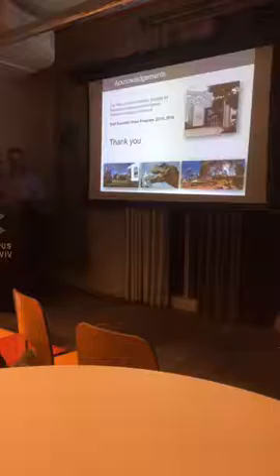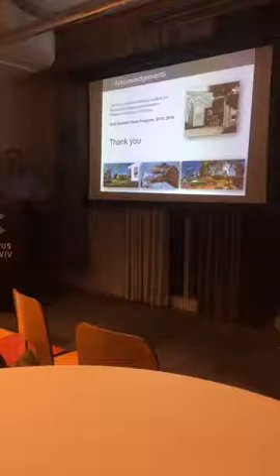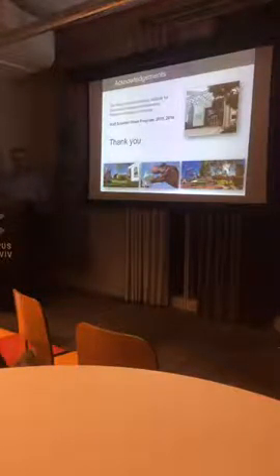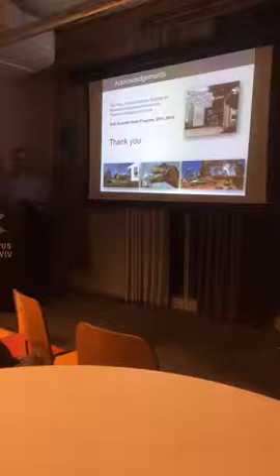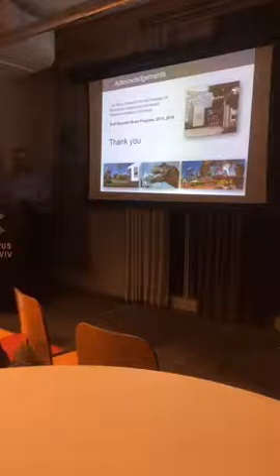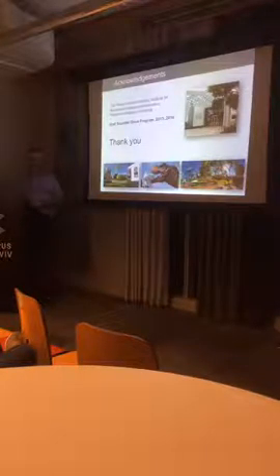Can you develop it so that, let's say, you take a mouse and you do this kind of imaging, and then take the same mouse 6 months later, and you do the same. Can you overlay one on top of the other and only highlight the differences? Yes, it's more image processing.